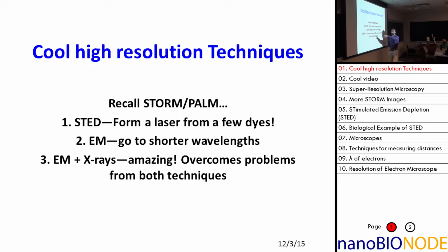Then, in fact, EM and X-ray together is a super powerful technique. It overcomes essentially both of these problems, and we'll discuss how that is. And I should say, if I were to start over my career and work on a new project, I might indeed do this combination of EM and X-ray diffraction. So I'll try to give you a sense of why I'm so thrilled by it.